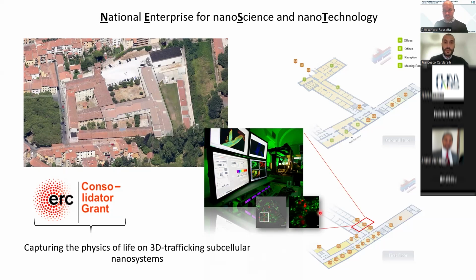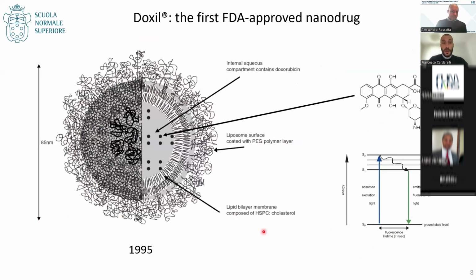More in detail, I work in the field of nanomedicine. And in nanomedicine, I will briefly build a case study that demonstrates the potential of fluorescence lifetime analysis and the impact that the FLIM Starter Kit Alessandro developed can have.